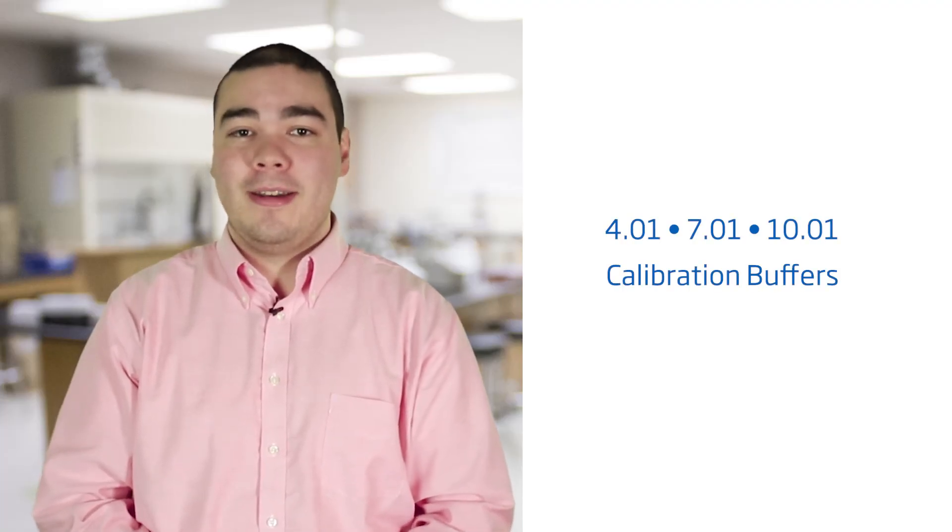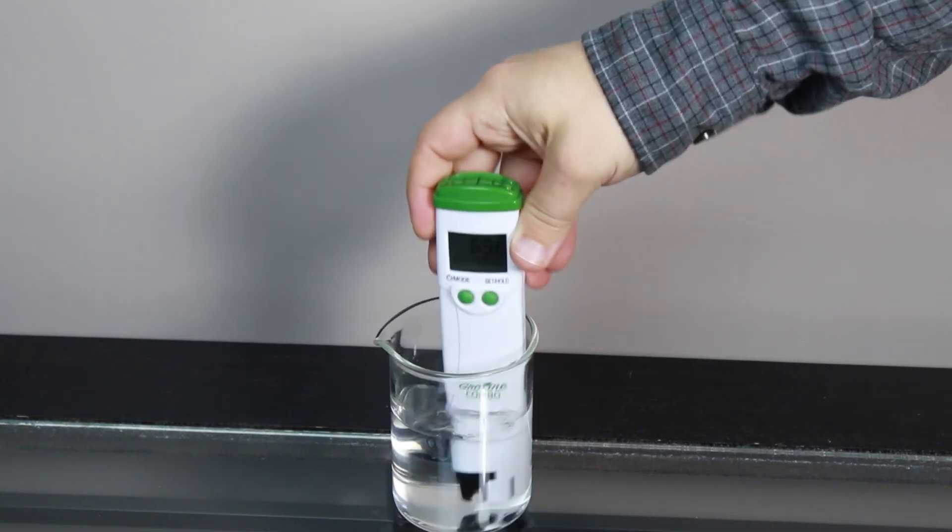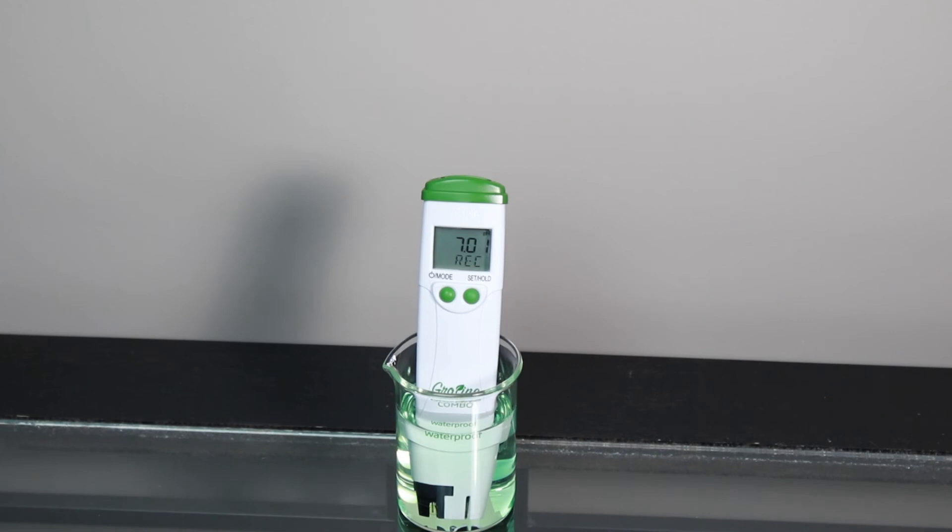Your tester also uses standard 4.01, 7.01, and 10.01 buffers. To calibrate your tester to two points, first be sure you are in the Cal Standard setting. Rinse in distilled or deionized water and place the tester in your Hanna calibration buffer and wait for a stable reading. The tester automatically recognizes which one you use first, and once stable it will ask you for the next buffer.